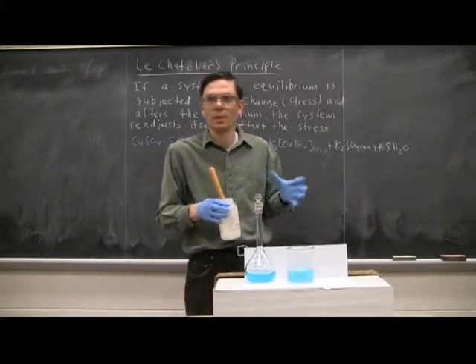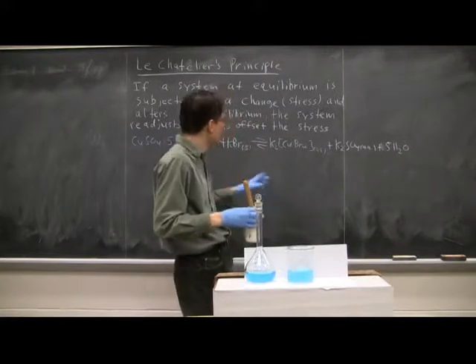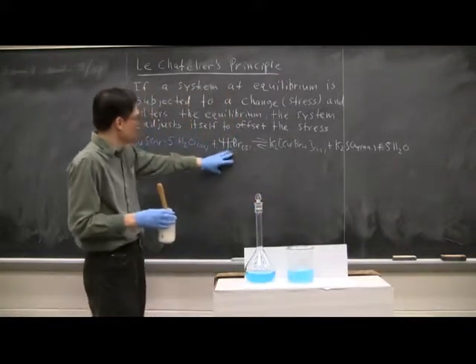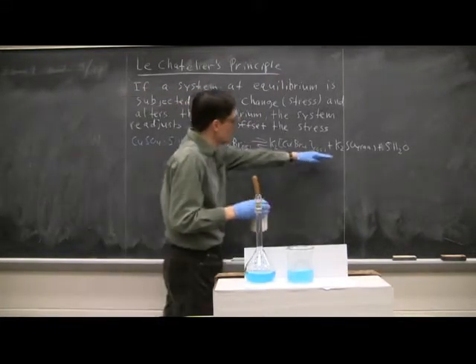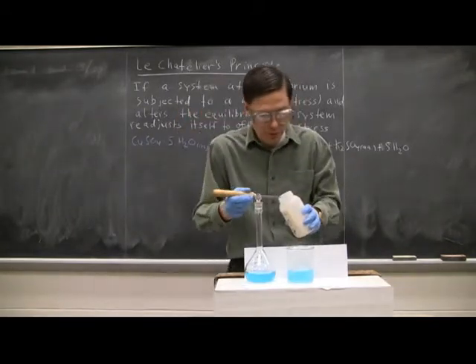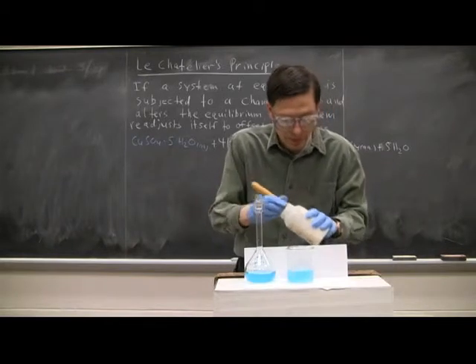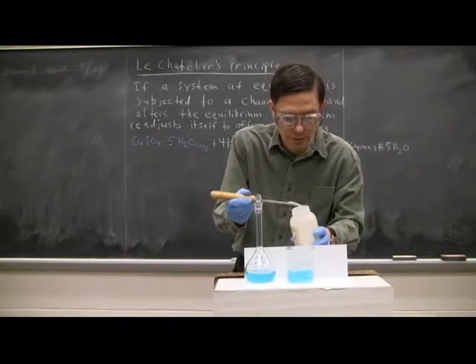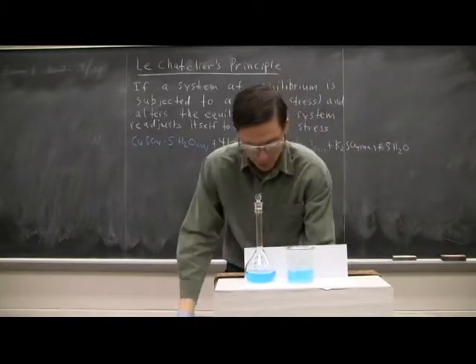Now what should happen is, as equilibrium is supposed to be, if you add some type of reactant, it'll shift to the product side. So let's see what happens here. It may take a bit, so I'll put a couple of scoops in and stir it.